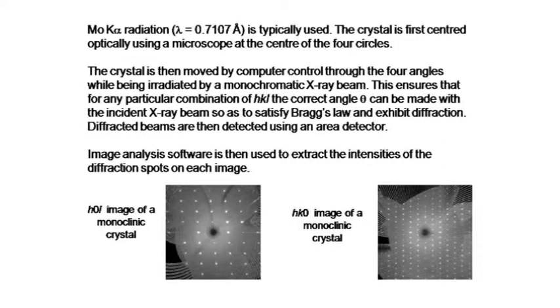Typically we'll be looking at organic systems, which have larger unit cells than the common inorganic systems that are typically run on a powder diffractometer. So they'll have generally one long axis at least. In order to see that quite well, and also to maintain the data quality down to lower d-spacings, molybdenum is a kind of optimum radiation.